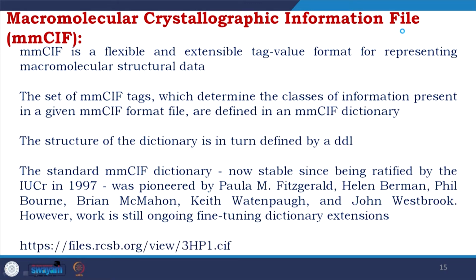This is the link of the mmCIF file of the protein whose unique structure is provided by the PDB ID 3HP1.